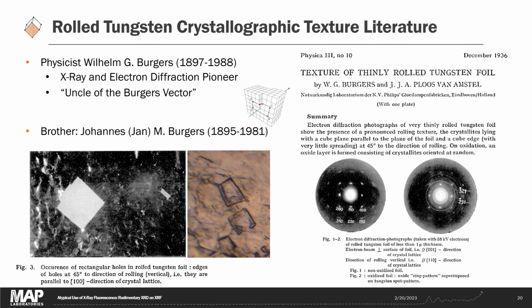The other complaint that the process engineers had was that the old vendor material, when they were trying to cut it parallel to the rolling direction or perpendicular to the rolling direction, which were most of the cuts they were trying to make, they were having a tough time with small debris particles flaking off, getting an uneven cut surface and bad finish. And I hope you can imagine, looking at these structures that are aligned 45 degrees to the rolling direction, why that might be the case. They changed everything so that they were aligning their cuts at a 45-degree angle, and at that point things machined much easier.